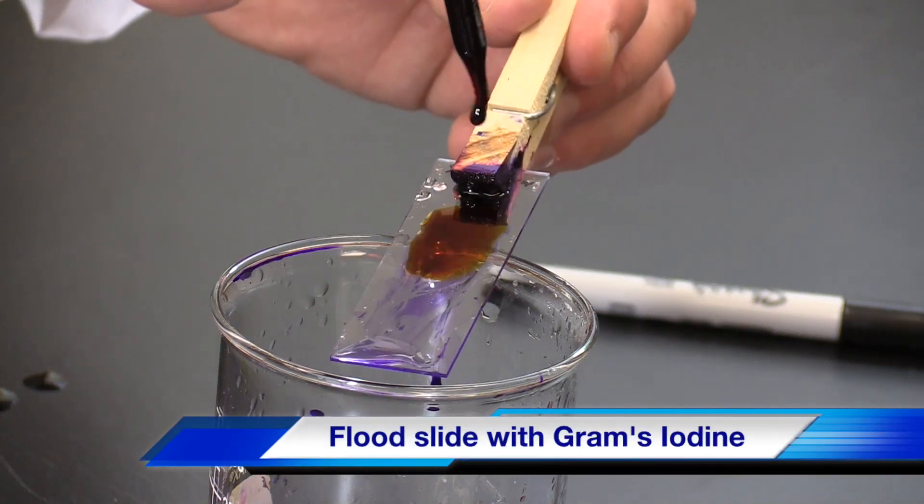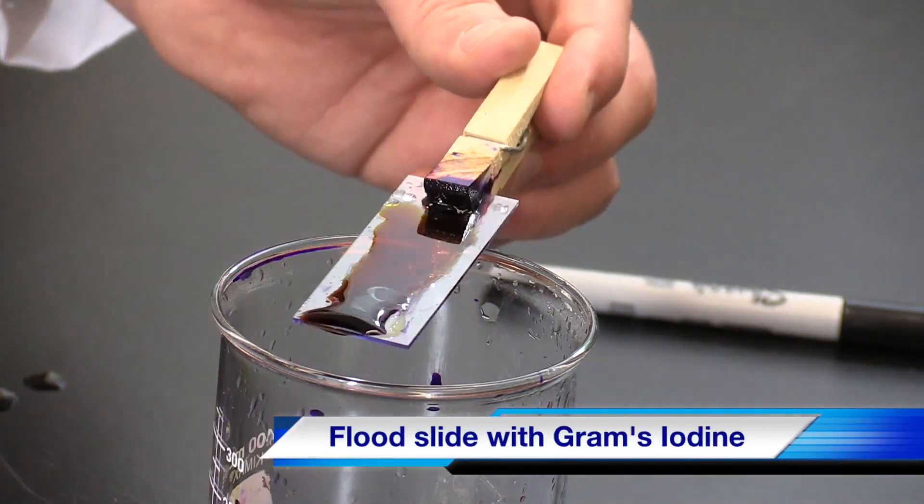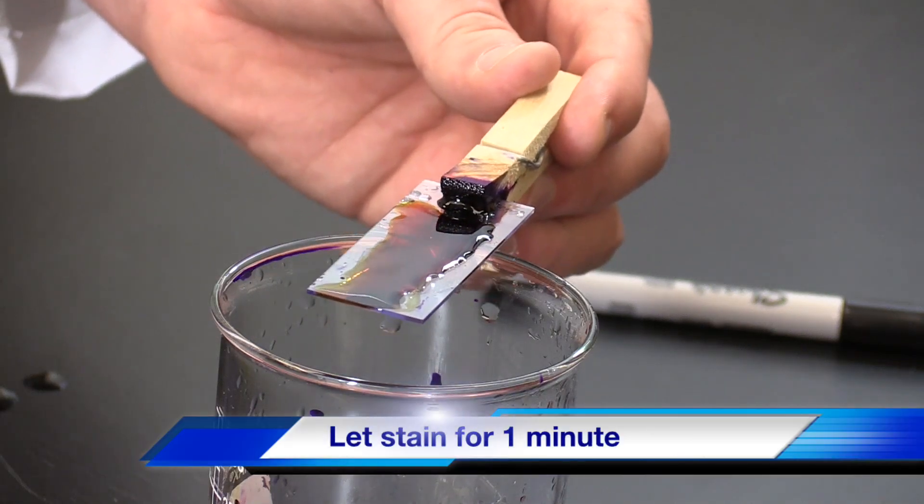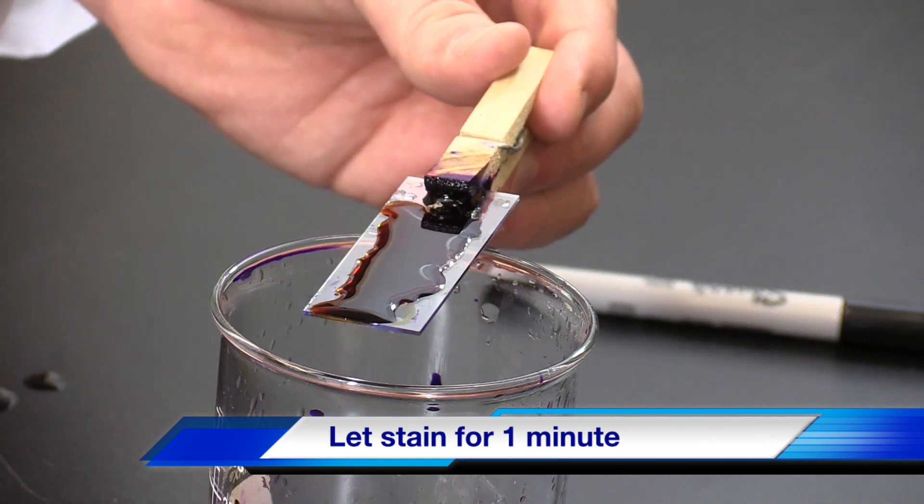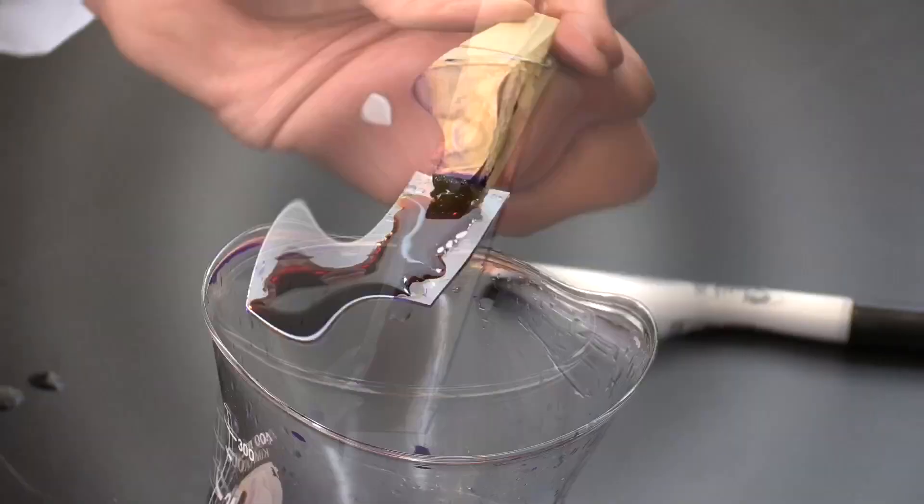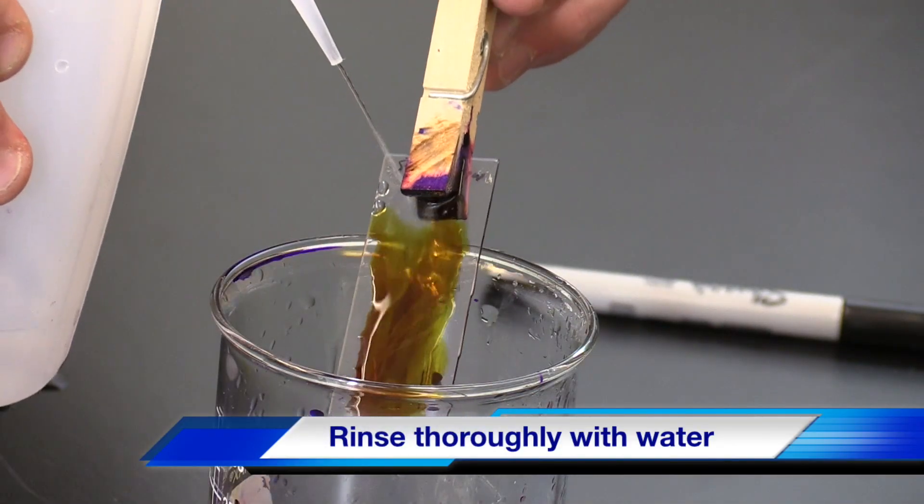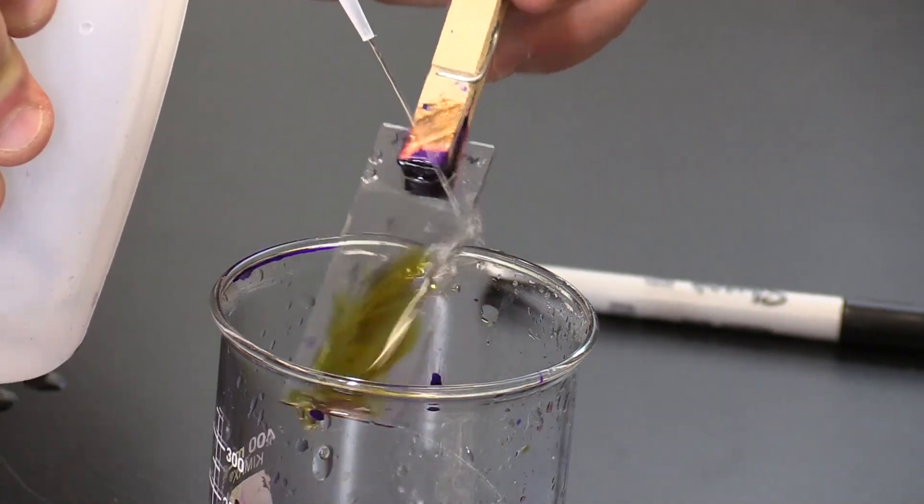Flood the slide with Grams Iodine to cover the bacterial smear and allow to stain for one minute. Rinse the Grams Iodine away with water until the water running off the slide is clear.